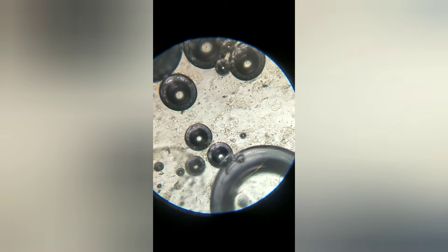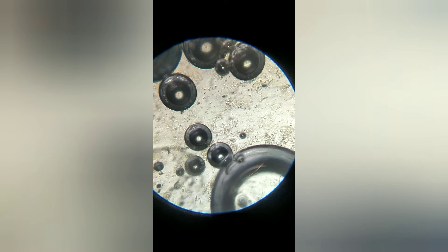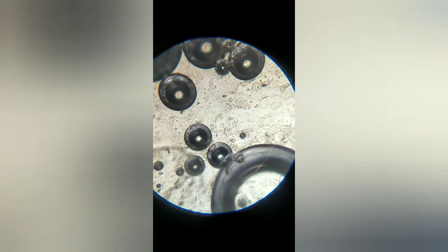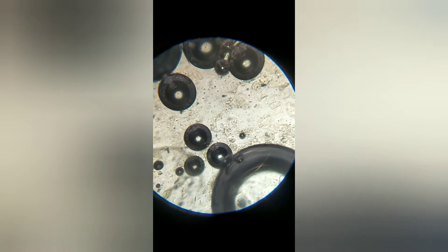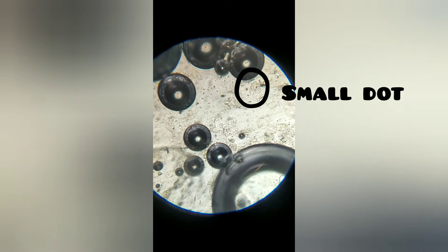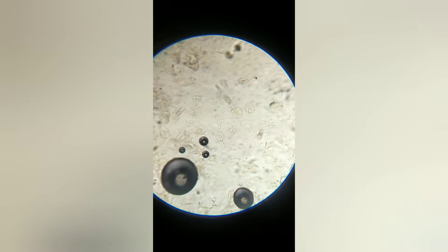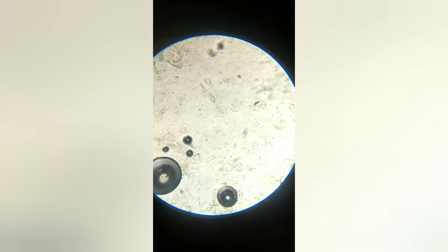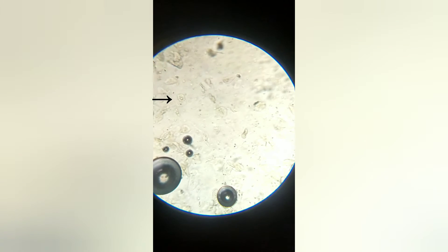As you can see, there are cheek cells also. They are the cells present in the interior part of the mouth, and they line all the interior part of the mouth - the roof of the mouth, the sides of the mouth. There is also a nucleus present there. These are all the cheek cells, and that tiny small dot inside that object is the nucleus of that cell.